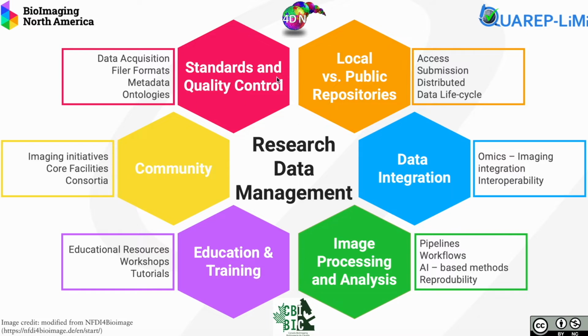These practices range from standards and quality control to, for example, image processing and analysis pipelines, and the development of communities where we can meet with other users, custodians, and manufacturers of microscopes to develop together the best procedures.